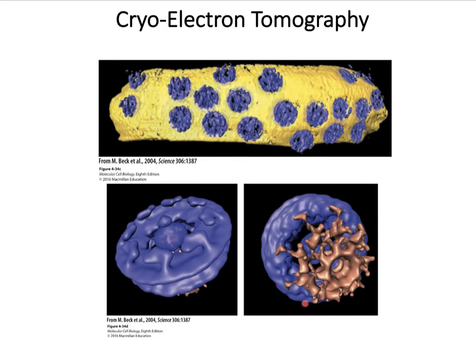You are familiar with the term CT scan or CAT scan in medical imaging. It stands for computed tomography or computer-assisted tomography, which gives a 3D image of the tissue in a patient's body by scanning tissues in different planes from which a 3D image is formed. In the same way, the cryo-EM images are collected by varying the stage angle a little, as mentioned earlier, and from that, a 3D image or tomographic image is formed, as shown above.